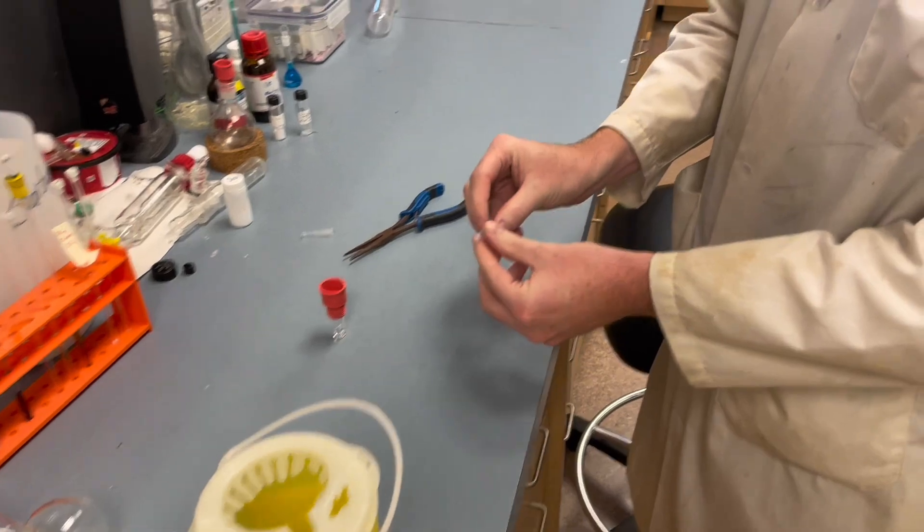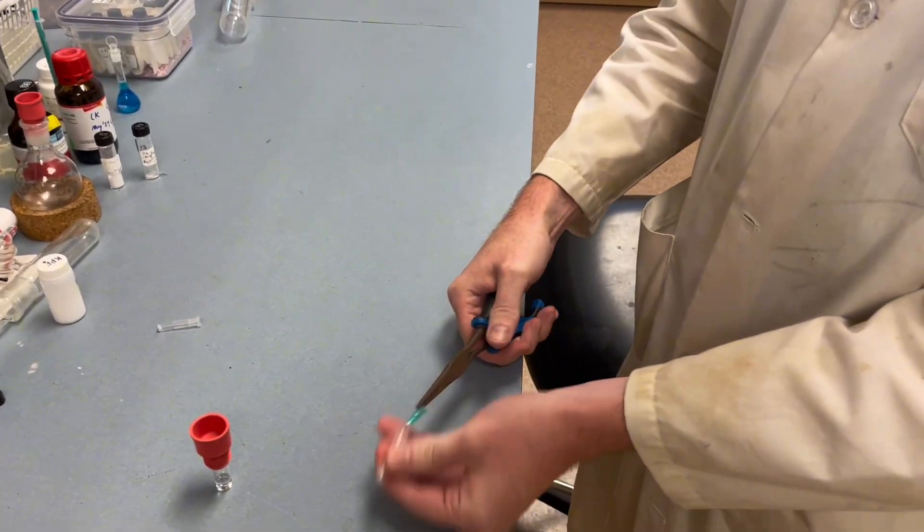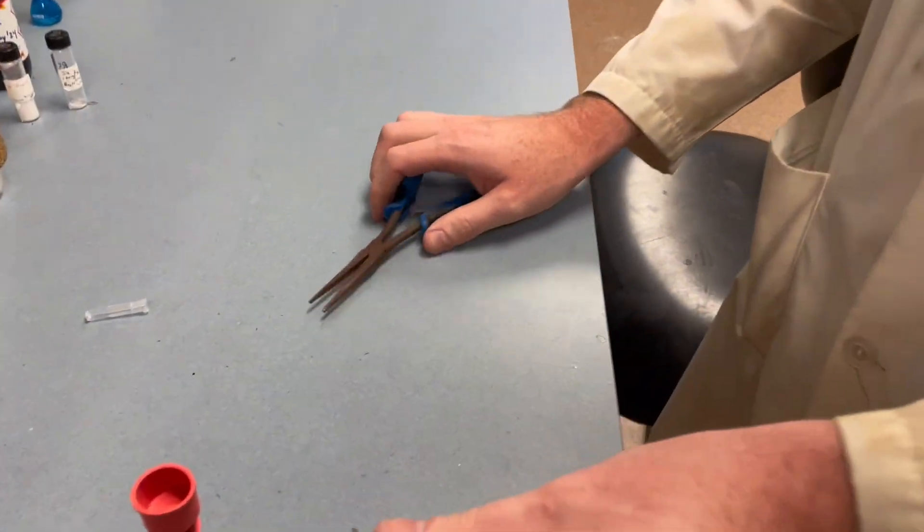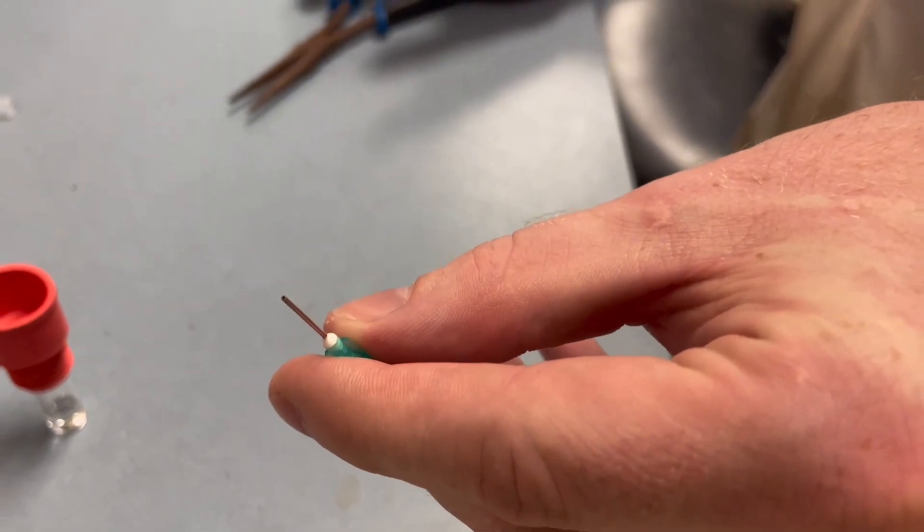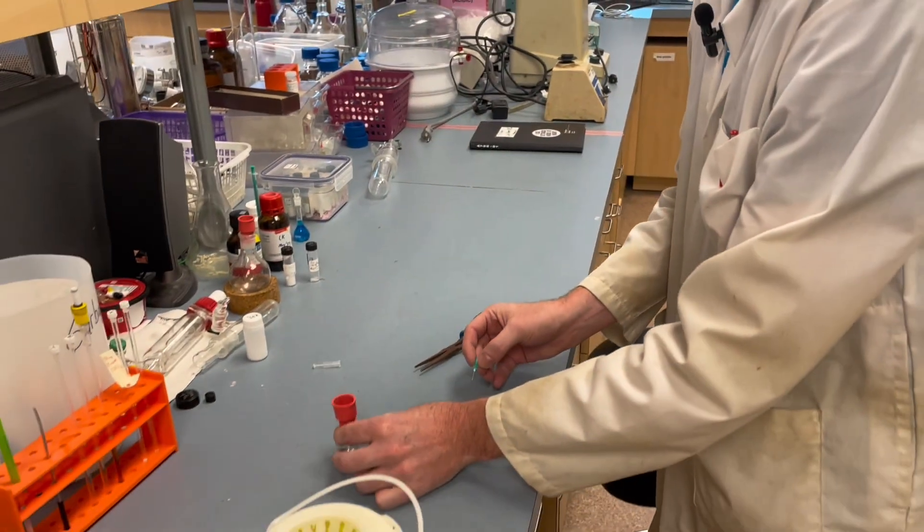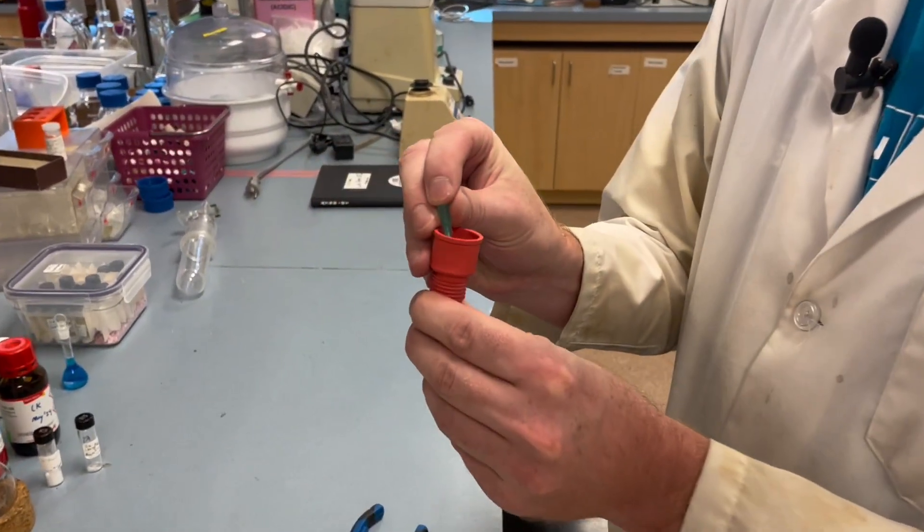Next we'll take our blunt tip needle and stick it through the hole in the septum which we pre-punctured.